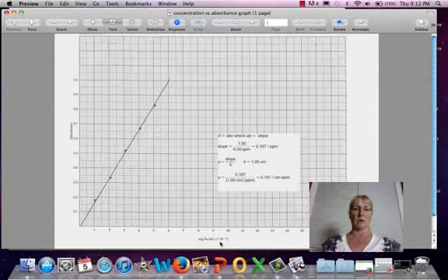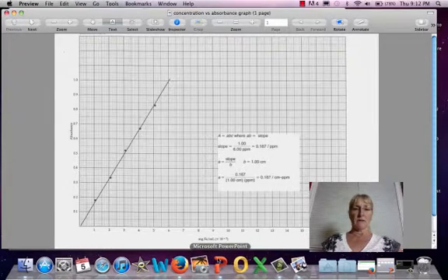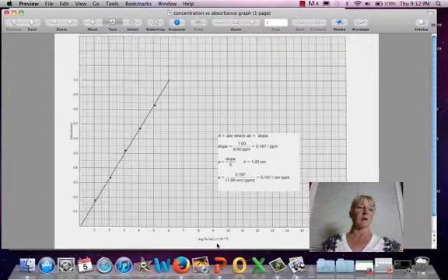This is one done with iron ions. These work well with metallic solutions of ions that have unique colors. So iron's got kind of a yellowy orange color. As you saw, the copper ions have a bluish color. They're measuring in a different unit of concentration, but I think that's relatively irrelevant.